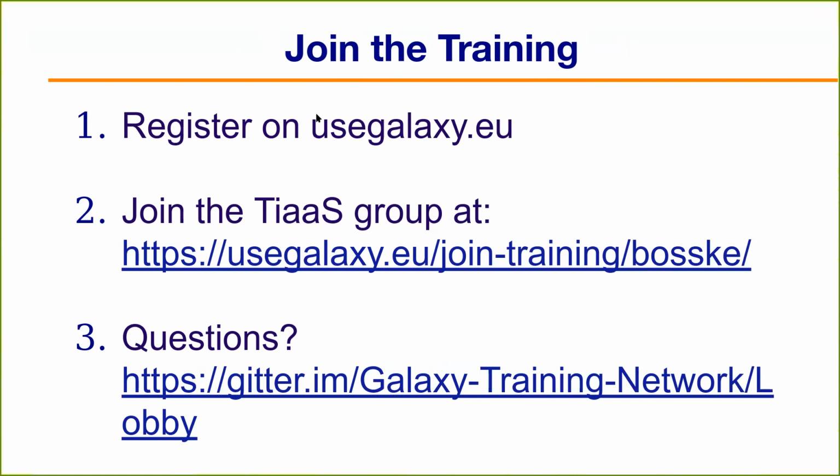First step, register on usegalaxy.eu. It's free for anybody to register, but just go there and register on that website. Then once you've registered, click this link, okay?